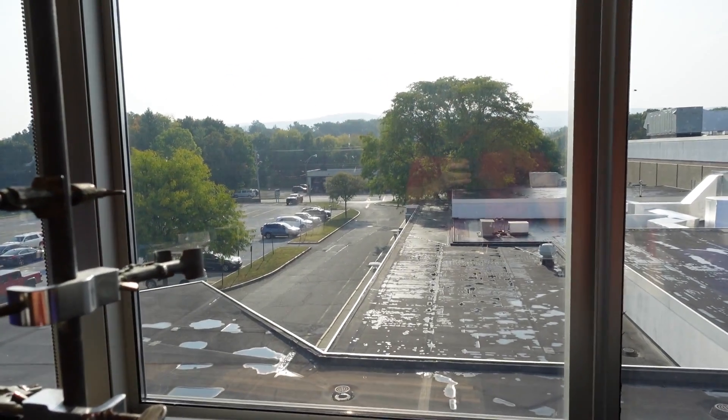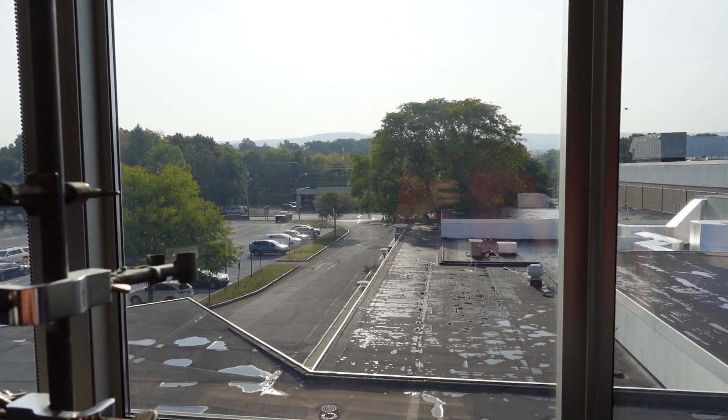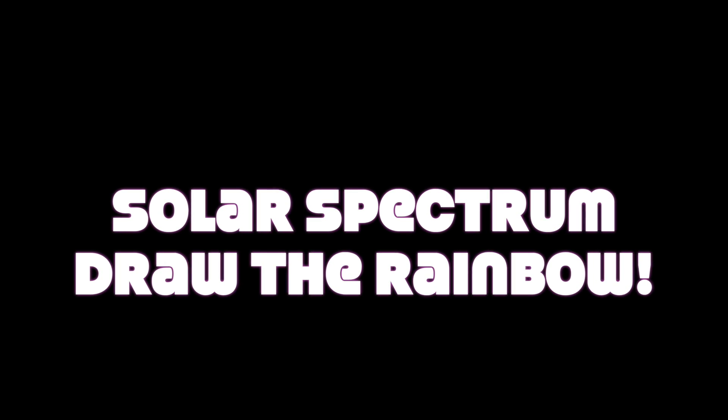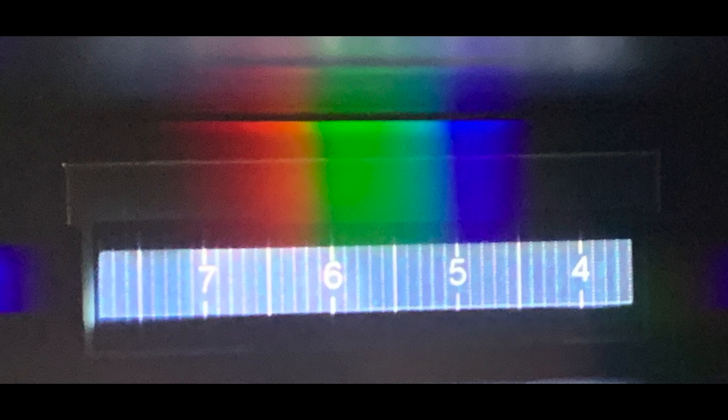Okay, now let's get the spectrum of the sun. Do the best you can, submit it, and if it's correct, great. If not, I'll say nope, try again, and you can go ahead and try it again. And that, ladies and gentlemen, is the spectroscopy lab.